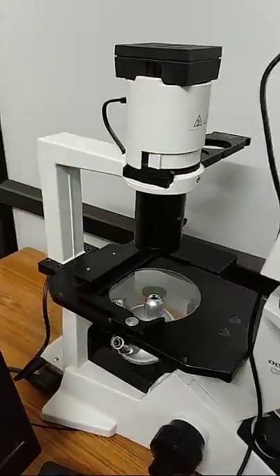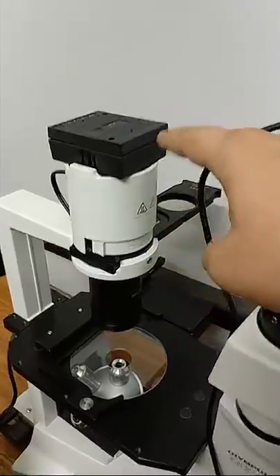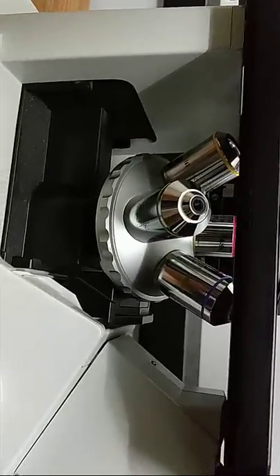Its construction and biological applications. An inverted microscope is a microscope with its light source and condenser on the top, above the stage pointing down, while the objectives and turret are below the stage pointing up.